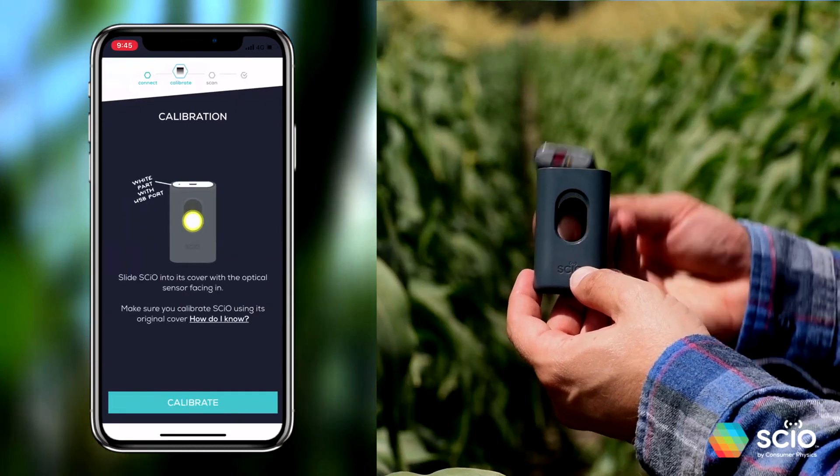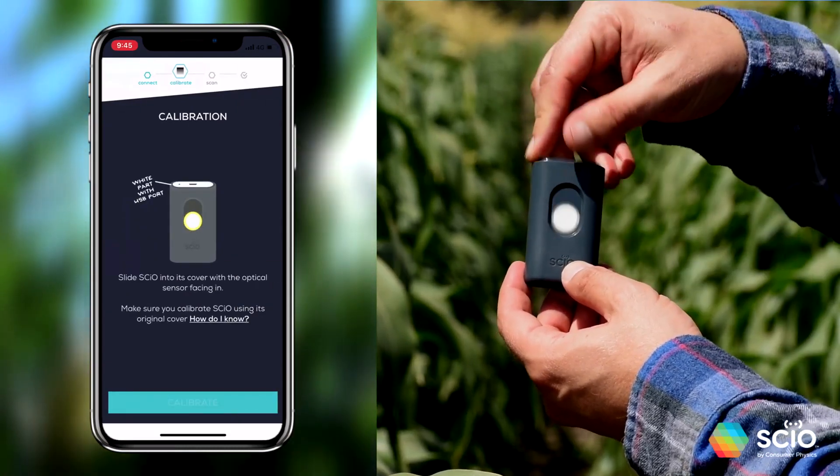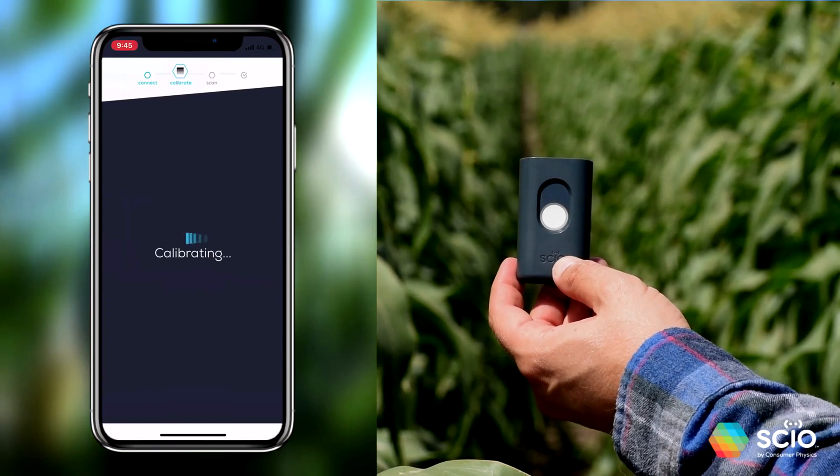When asked to calibrate, use the provided black cover. Don't forget to remove SIO from the cover when done calibrating.